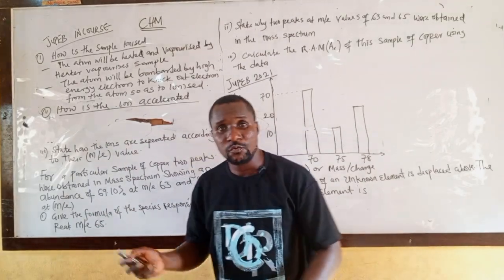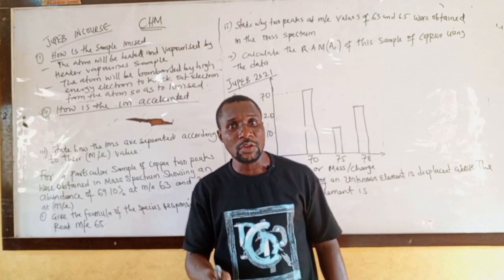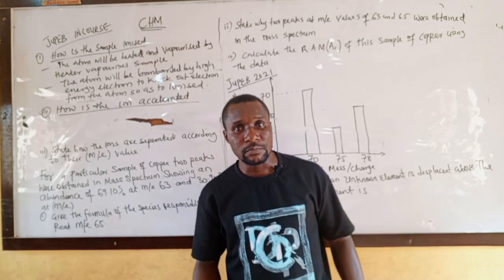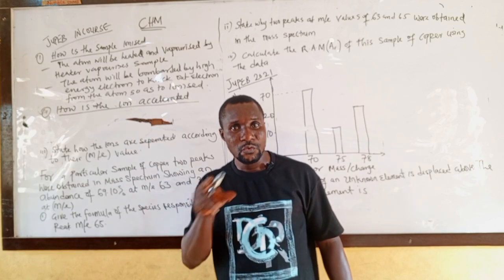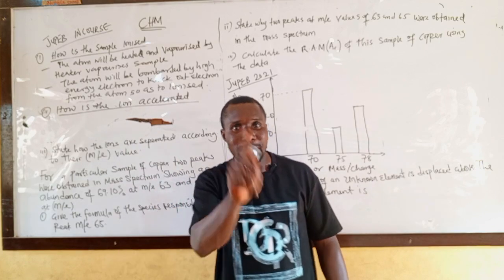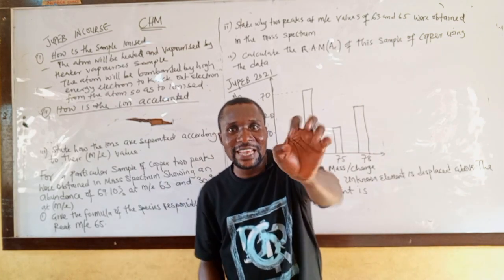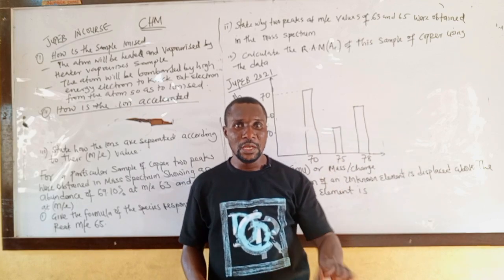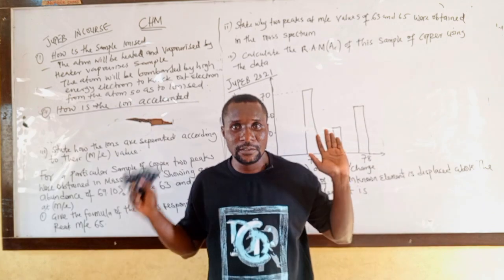Then the positively charged copper ion will be repelled by the positively charged plate, and the acceleration can be controlled by adjusting the charge on the plate.